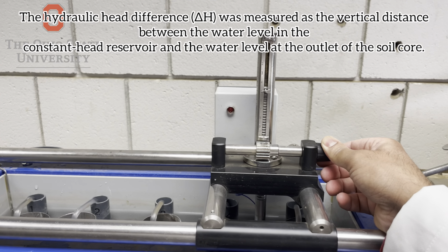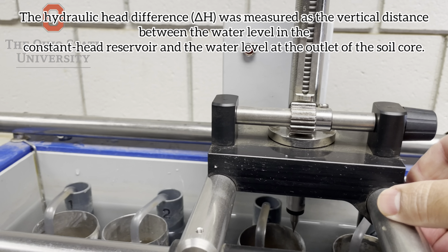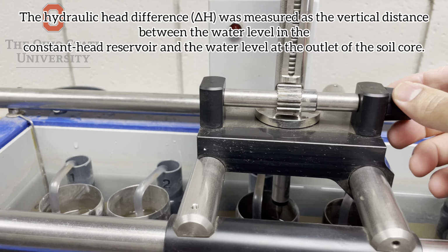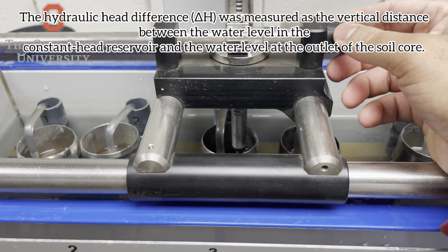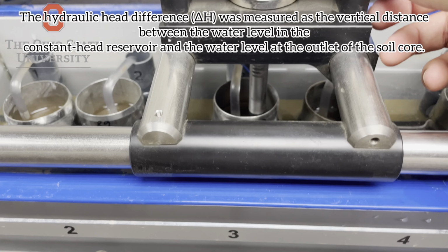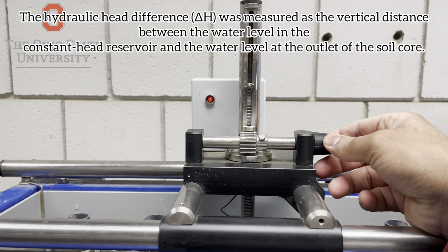Now let's talk about how constant head works here. In the constant head method, a fixed water level creates a constant hydraulic gradient. Water flows through the soil at a steady rate. Once steady flow is achieved, discharge is measured. Steady flow indicates that Darcy's law conditions are satisfied here.